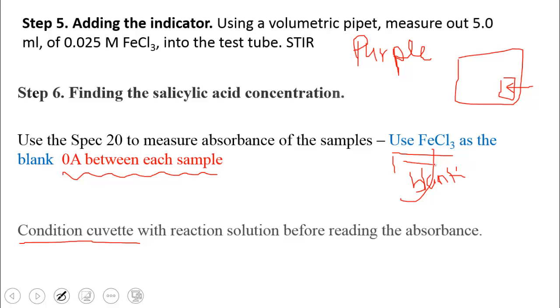And remember, fill it about 3/4 of the way up, okay? And remember, cuvettes typically have that circle on the top, so fill it to about halfway through that circle. And remember there's a line on there, and you do want to align that line on the cuvette with the line on the sample holder.